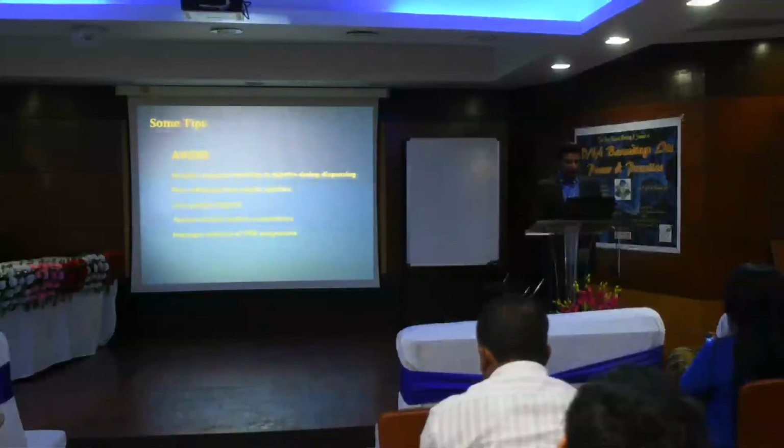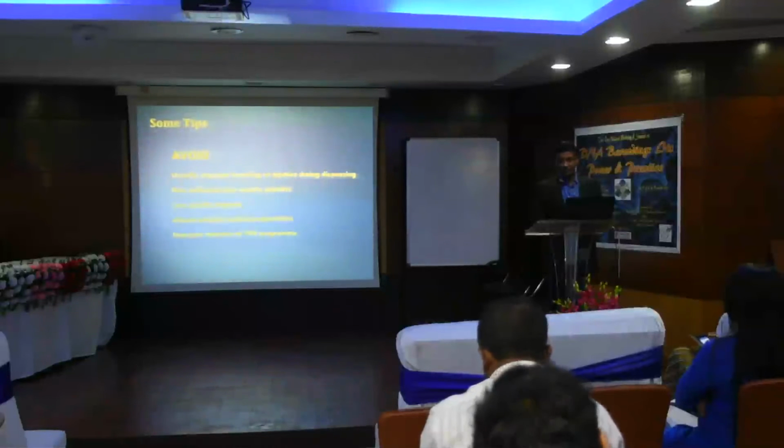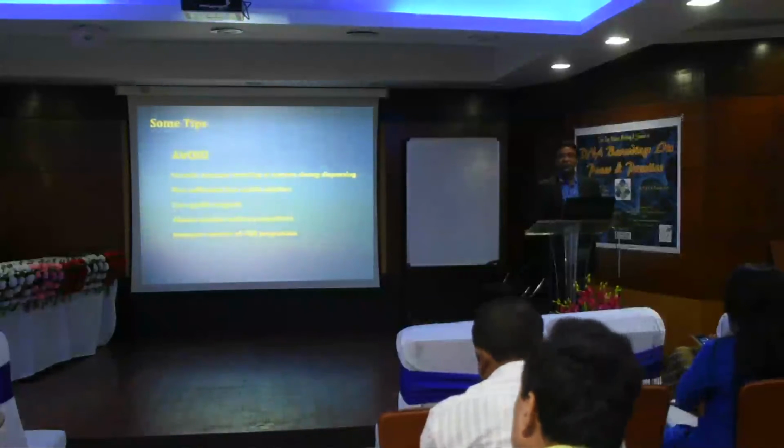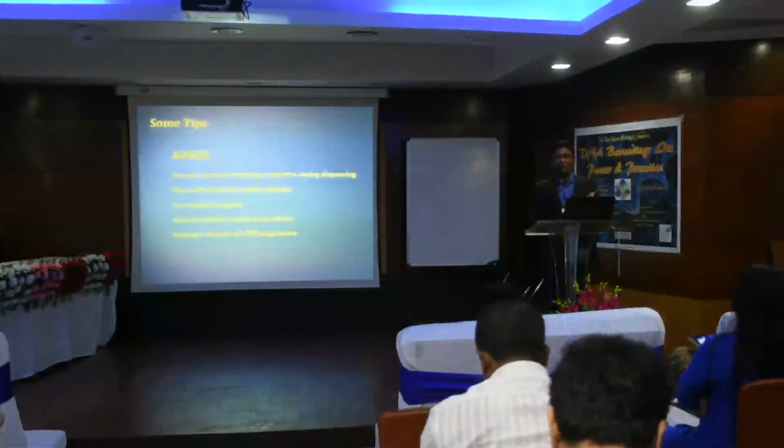Then I will suggest some more important tips, and then we will wind up this long lecture. So usually, improper handling of pipettes during dispensing. I was telling you some hefty guys, they can't sense. So such people should be avoided in PCR reactions. A good way: don't make them aware that it is a problem.